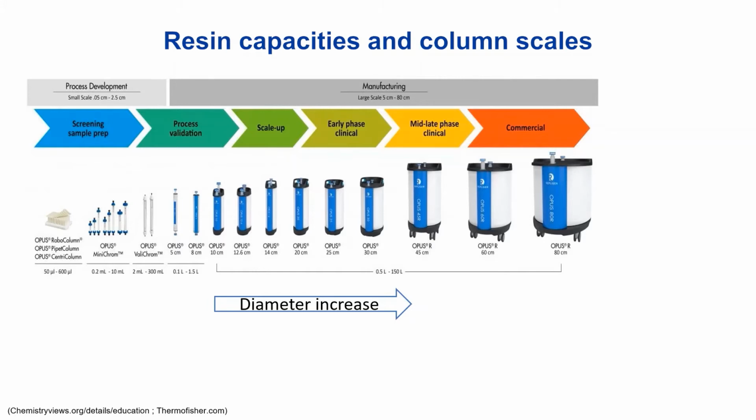In affinity chromatography, the volume of the sample that can be loaded on a column directly depends on the resin capacity and size of the column. This value varies from milliliters in small scales to cubic meters in industrial scales. Many different types of columns with different sizes are available in the market. Based on the dimensions and some resin factors like mechanical and chemical stabilities, flow characteristics, and the most important one, their binding capacities, they can cost between a few hundreds to several $1,000s.